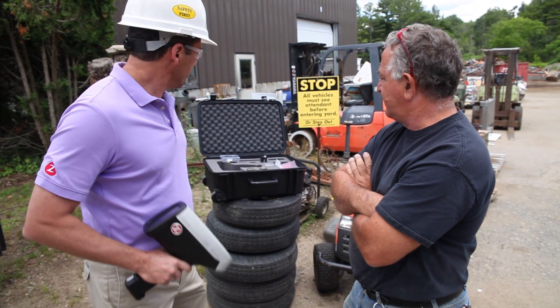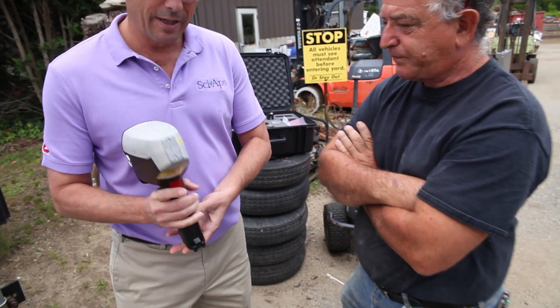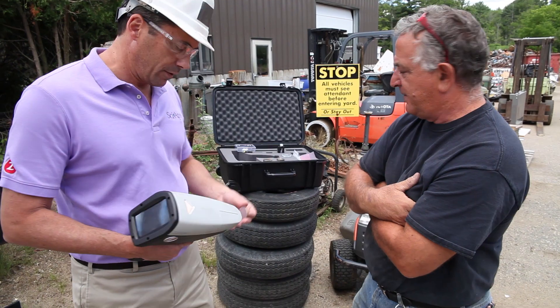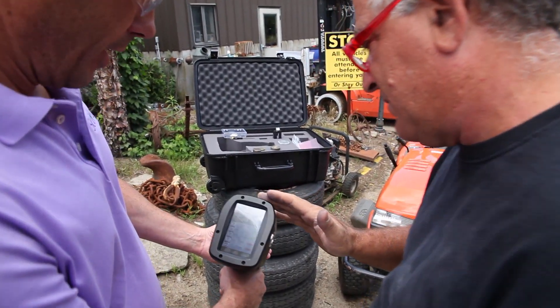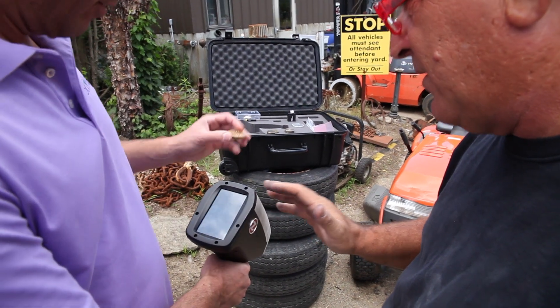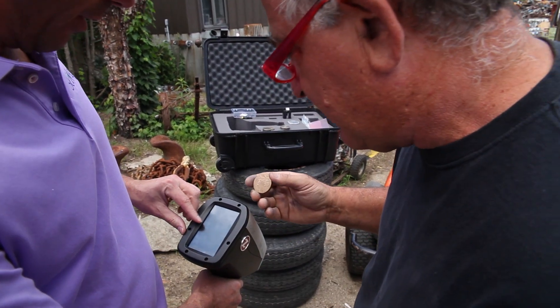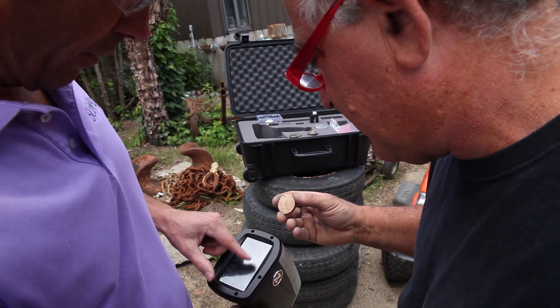The batteries should be good for a good eight hours. These don't draw power except when they're actually firing, which is only for a few seconds — they don't really draw much power. When you shoot stuff, you pull the trigger, you can see the plasma being made, and there's your ID right there. There's your 836. So you get your chemistry, your grade ID, and a great comparison for things that are in or out of spec.